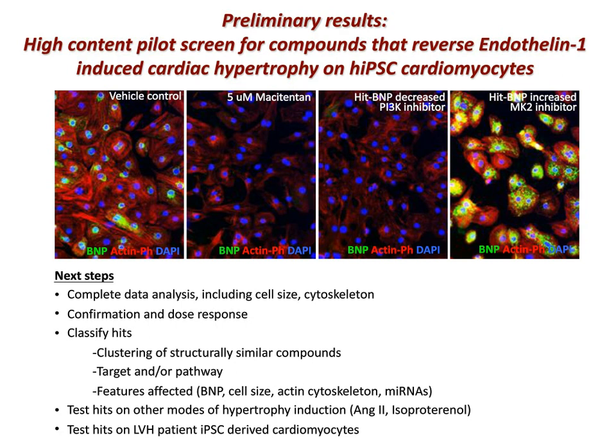So in summary, based on our preliminary studies with these cells, we're convinced that iPS-derived cardiomyocytes have great promise for drug screening.